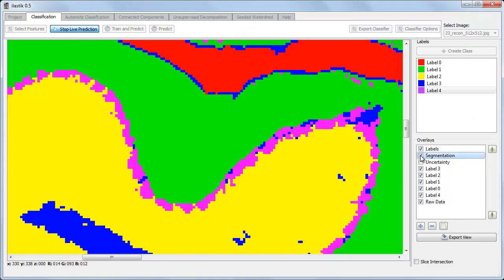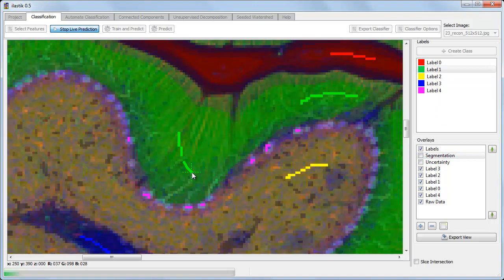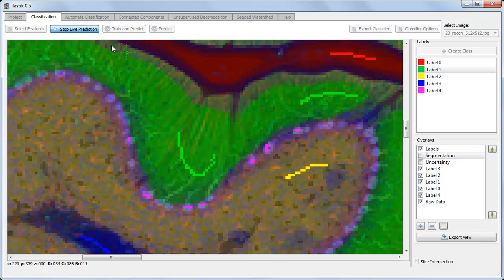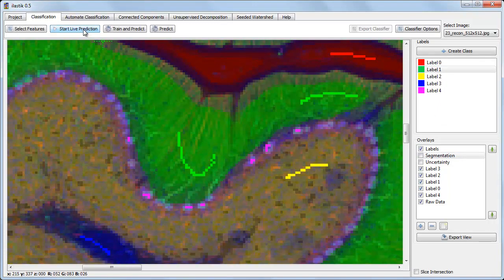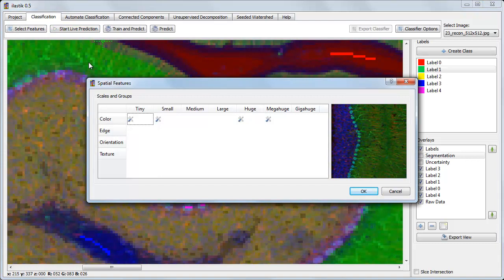And the results actually already look pretty good. I can try to improve the results by further labeling more areas of the image, and by selecting more features if I think they'll be useful.